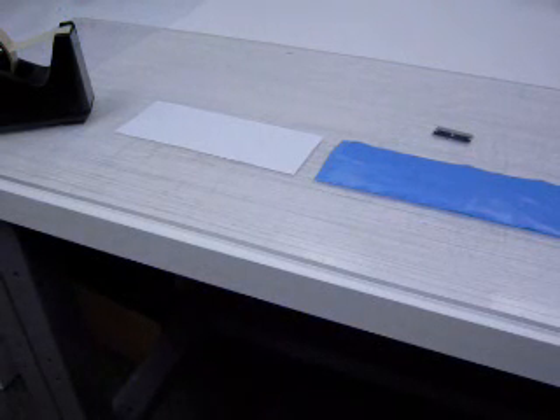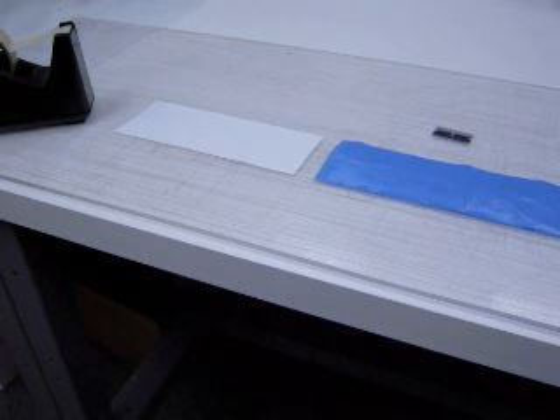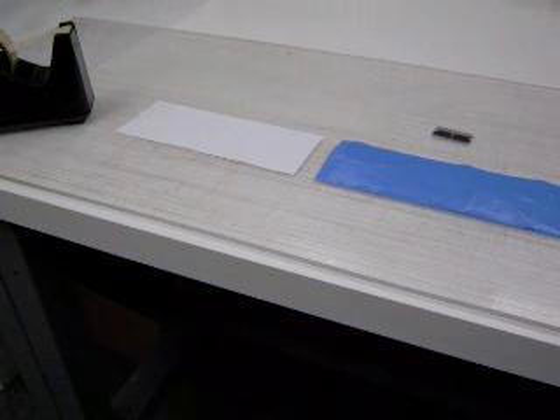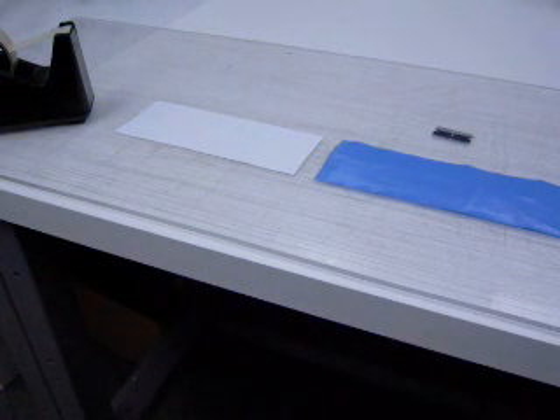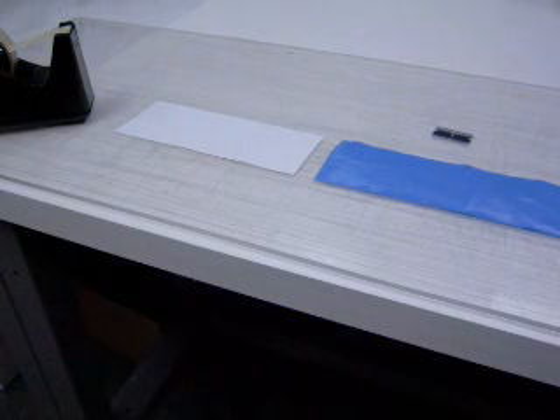Care must be exercised when handling sample specimens. The test surface must be kept free from external damage or from foreign matter that may change the surface characteristics of the specimen and be measured in error. Plastic films and sheeting may exhibit different thickness properties in their respective principal directions due to extrusion effects. Specimens may be tested with their long dimension in either the machine or transverse direction, but it is common practice to test specimens with the long dimension perpendicular to the machine direction.